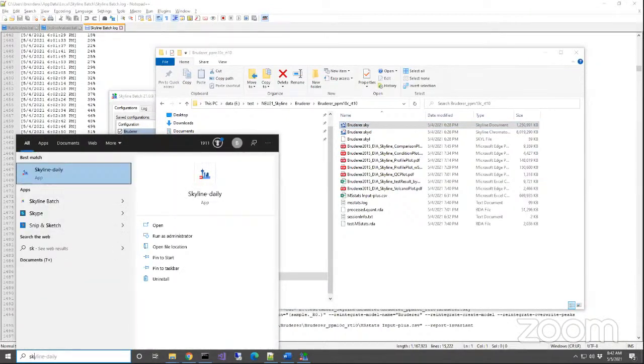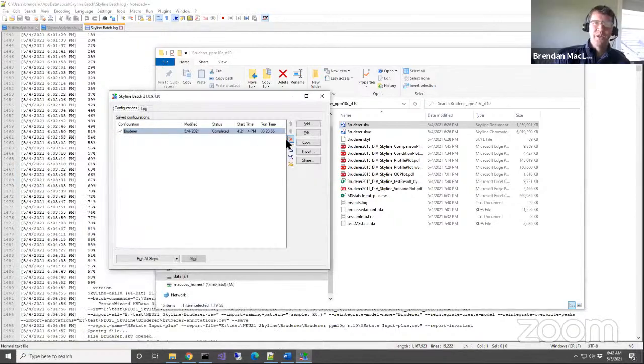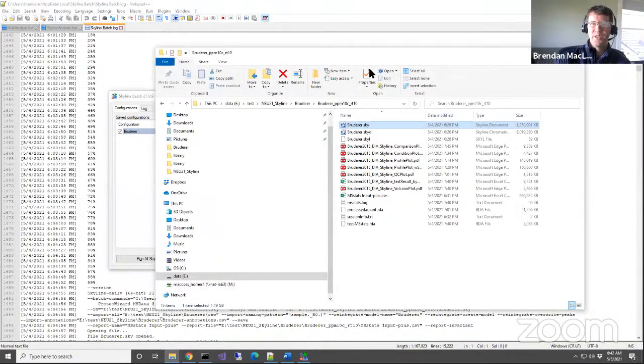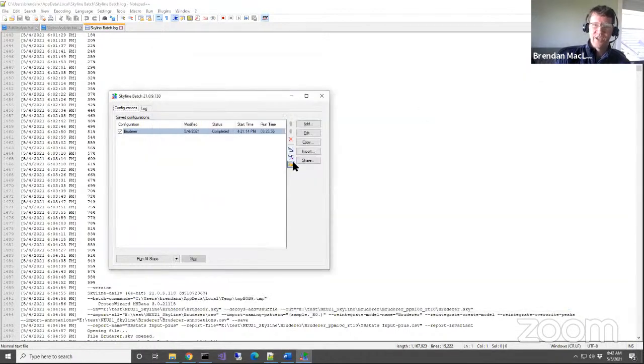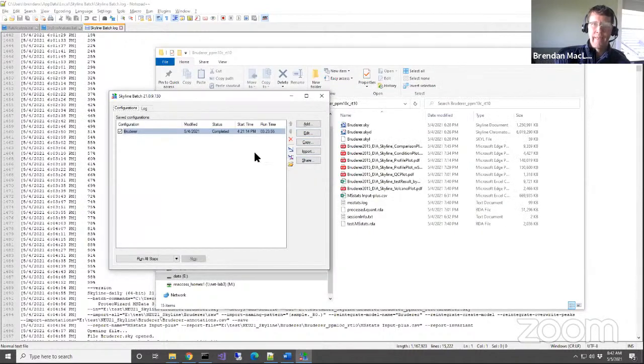Brendan? Yeah. Actually, if you use Skyline Batch to open that results document, it will open it in the correct version of Skyline. Oh, that's even better. So Ali added all these nice little things. An easier way to get to this folder for the processing is I could just click open folder, and boom, I'm right at that same folder we were looking at. And then open results file, and this is the open template file.